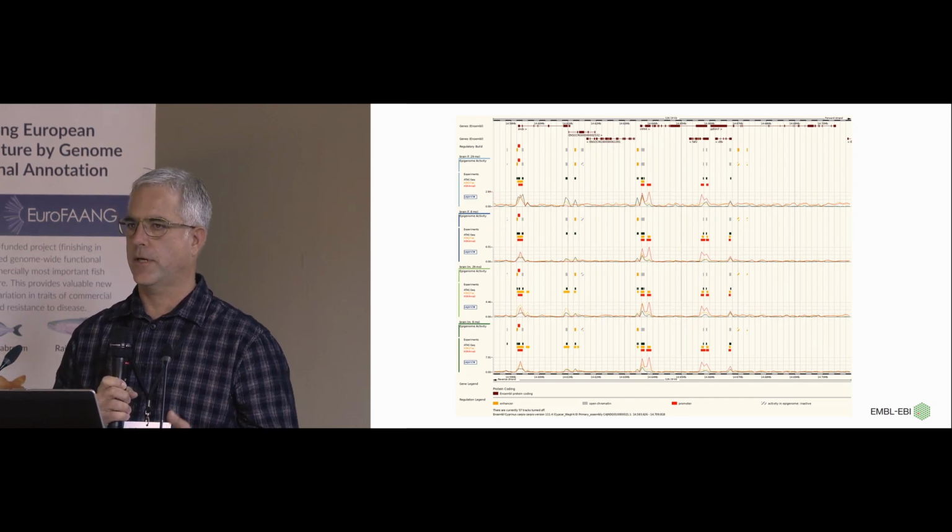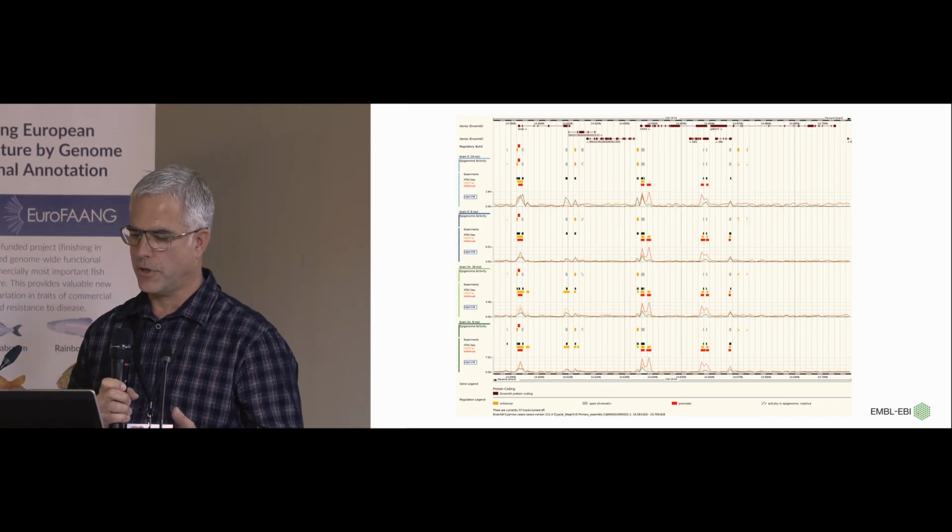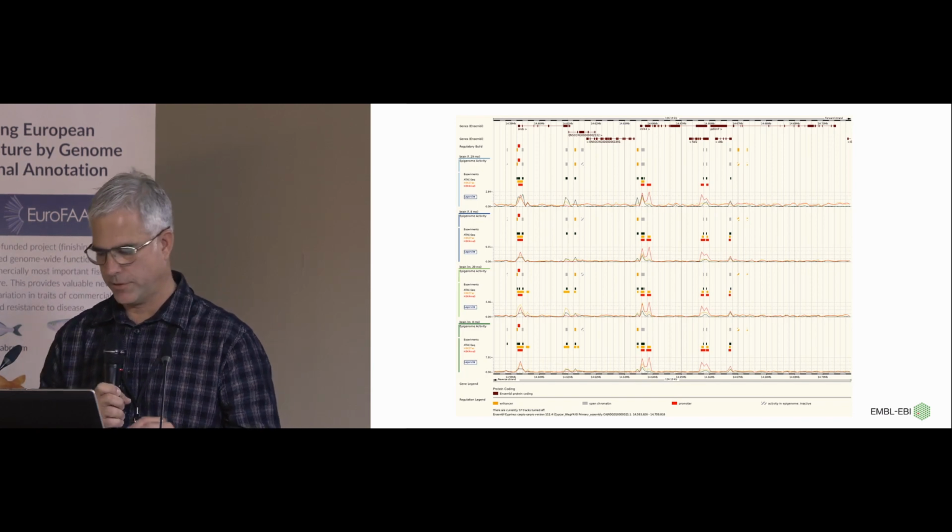And that can give you a good indication that in this particular locus, the data is really coming through strongly and can be more reliable than one where you're seeing quite a fair degree of differences.